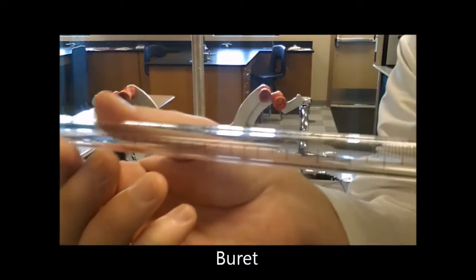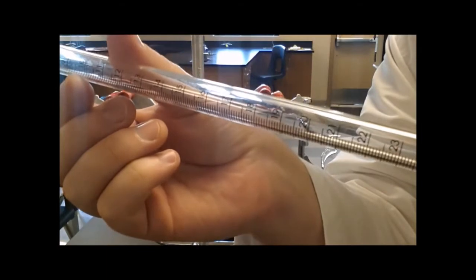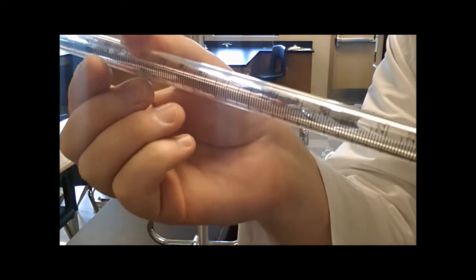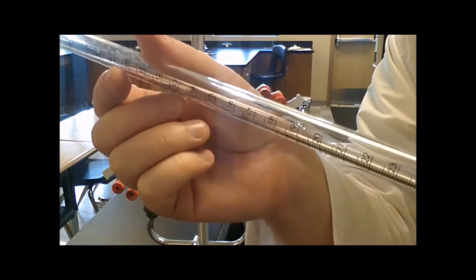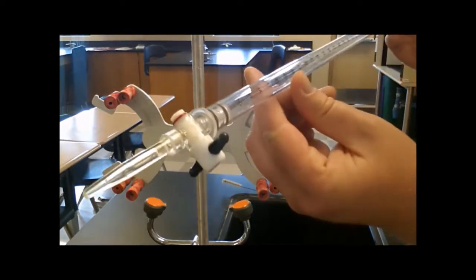The Buret has volumetric markings on the side. Each whole number is a milliliter, and everything in between is a tenth of a milliliter. So you can actually get hundredths of a milliliter out of this, two decimal places out from milliliter. Very exact measurement.